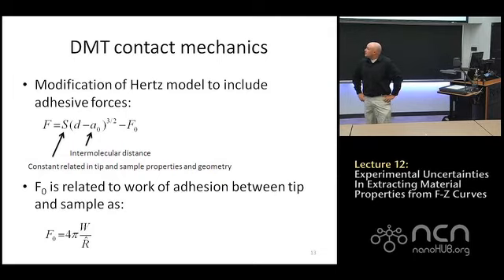And then our fitting parameters, because what we're going to do is take this model and fit it to our data. So our fitting parameters will basically be indentation and our maximum adhesive force. So we have two fitting parameters in this case. And then if we want to go a little more into what our maximum adhesive force is, we can relate that to work of adhesion between the tip and the sample, which is not a material property, that's a system property. But it gets tricky to relate that to surface energies. You run into issues where the surface energy of the tip is much, much higher than the surface energy of the sample, so it gets complicated. I don't know of any real works that have done this particularly well.